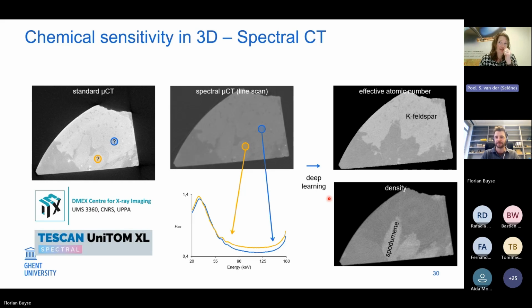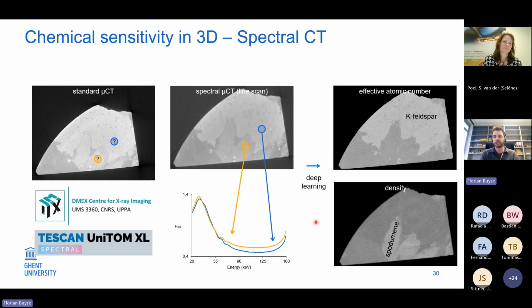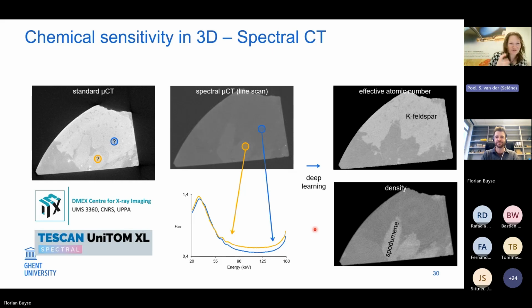Right, and you would say that it would have a better chance using this in combination with the neutron CT, right, to get like the whole spectrum. Yeah. Well, all the elements that you can pick up. Basically, it's just an example of how complementary information can lead to better identification. Yeah. Great. Yeah, I like it. Just like multimodal, multidisciplinary. I think that's really nice. A nice example of that.